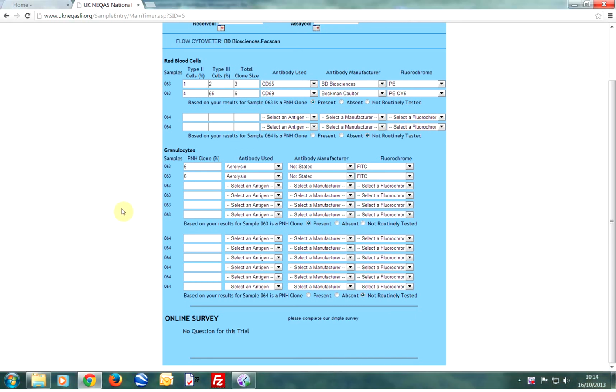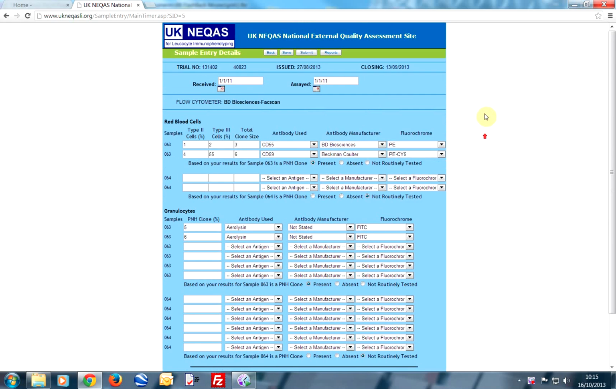The final section of the page is headed Online Survey. If an additional question has been asked with the trial, then it will be displayed here together with a drop-down menu detailing a selection of answers. If there is no question, please submit results.